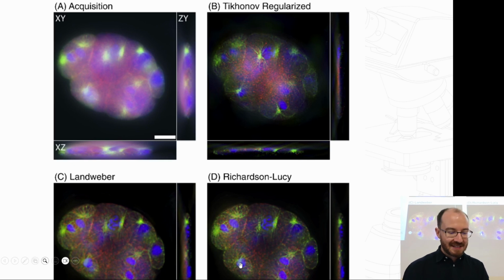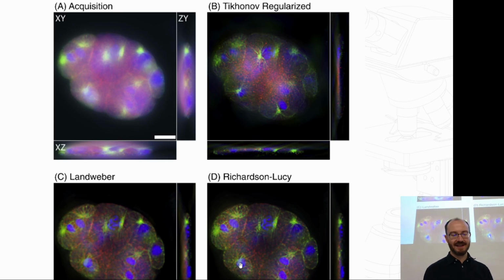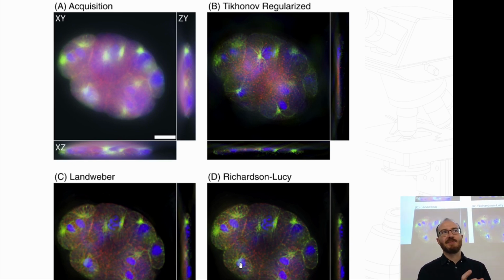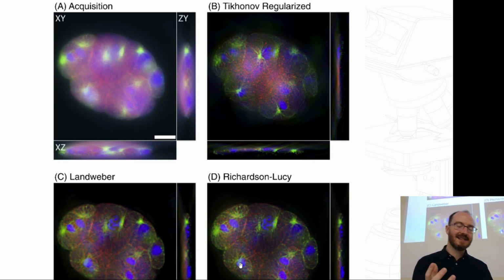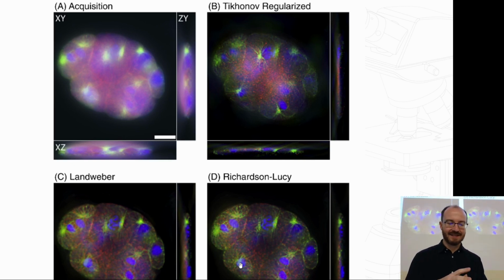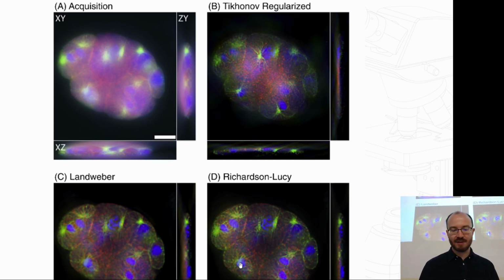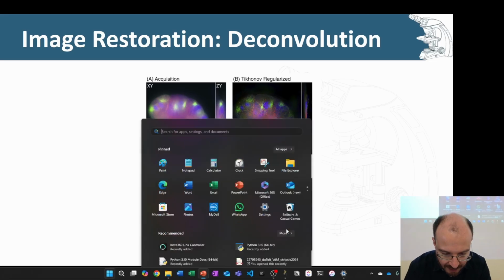So just be aware that there is no best result. There is a judgment call that you have to make to say, what am I visually expecting to see, and after deconvolution, did it clean it up in a way that I deem appropriate? It has sharp edges, but it didn't destroy the structures. It's highlighting the things that it should be. It's pushing away the noise. It's a very subjective judgment call, in all honesty, to decide what parameters to use, to decide what method to use, etc. And I just want to show you, like I was saying, some of our experiments here.